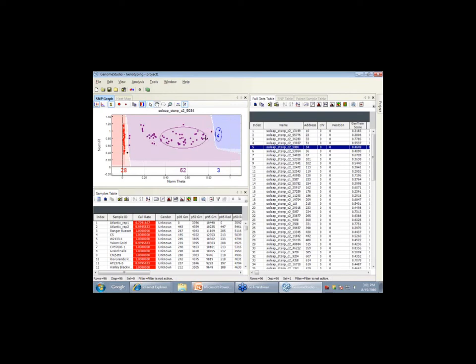You can shrink that and make it as tight as you like. And see, notice that I've made the circle a little tighter. I've also excluded these data points. Now these data points are going to be excluded; they basically get a missing data point. Anything black is a missing data point. It's not going to make a call on it.